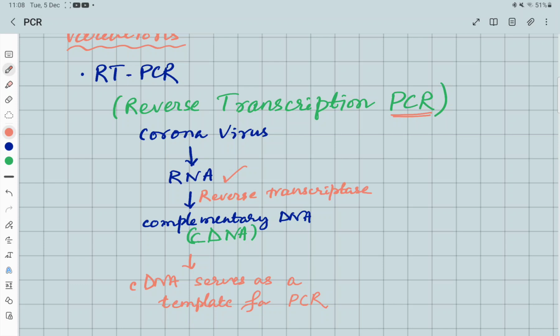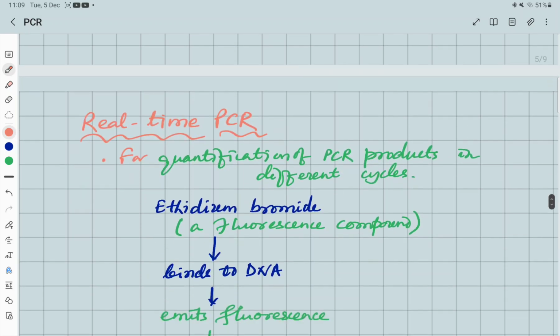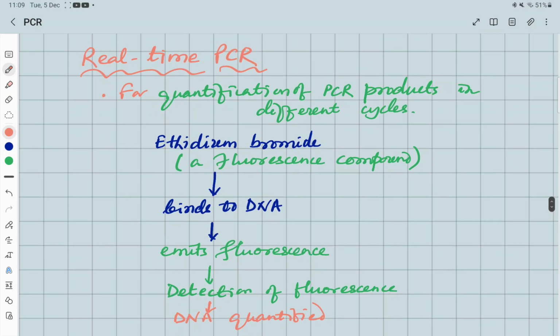So we call it RT-PCR, reverse transcription PCR, and you know the coronavirus is an RNA virus. So during this COVID-19 pandemic, RT-PCR was very common. You must have heard about this. The RNA sample is first converted to its complementary DNA by use of reverse transcriptase, then the same process as PCR follows. Another variation is real-time PCR, and this is a quantitative technique.